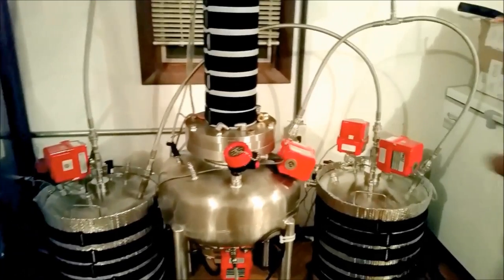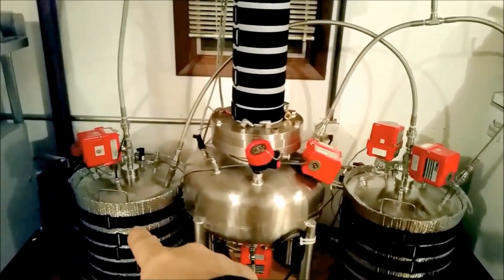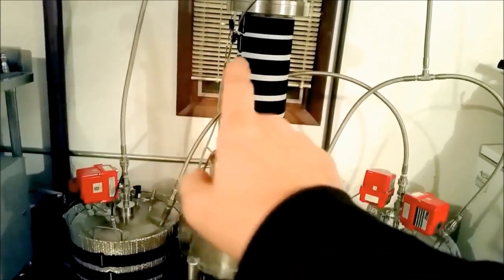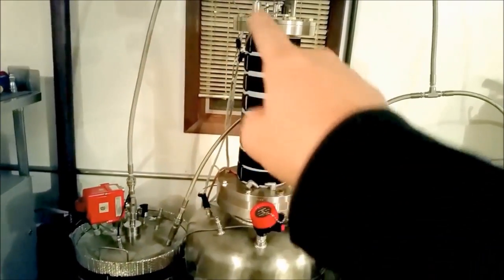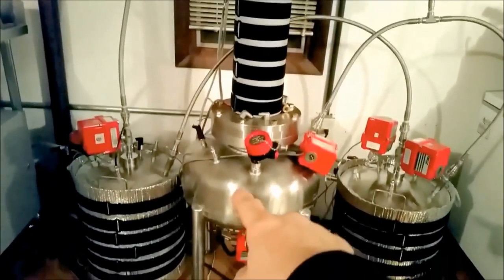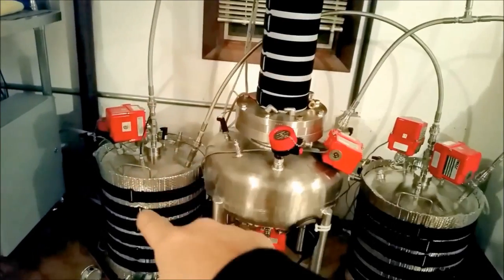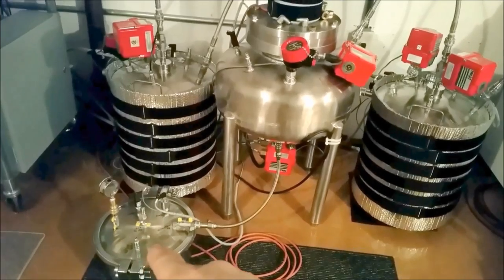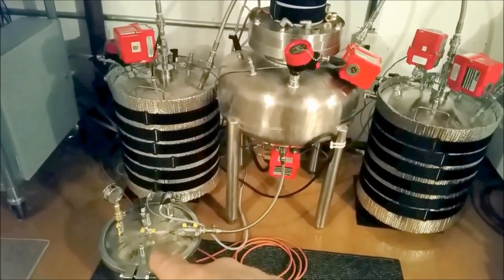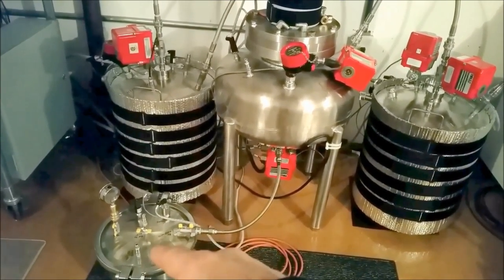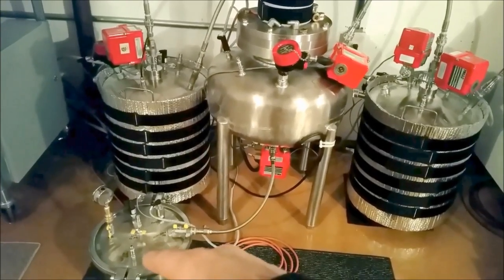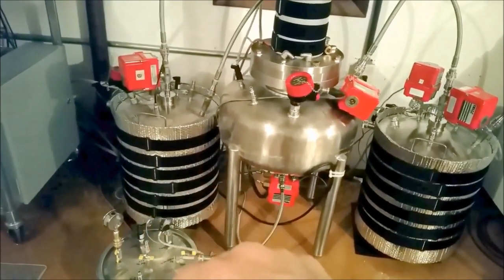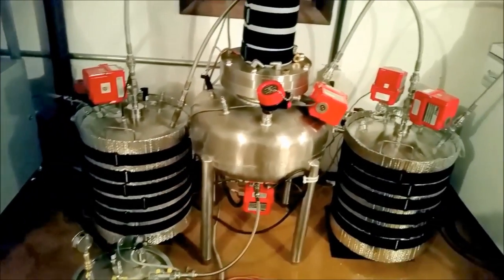This is a two tank system. We have one tank here and one tank here. There's also an option to just use this one tank. So you use the solvent delivery tank to send solvent through, and then it recovers from here back into the same tank that it was sent from. It drains the extract into this bottom tank, and then the final bit of extract that drained into here, that was carried through here with butane into this tank, has recovered back into the same tank. That process is a single tank system.